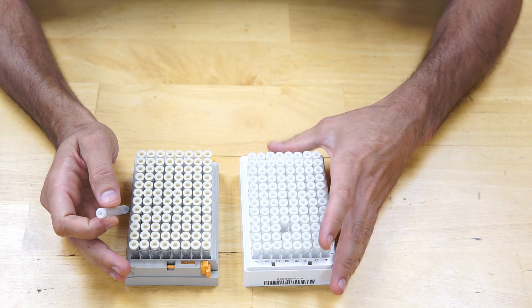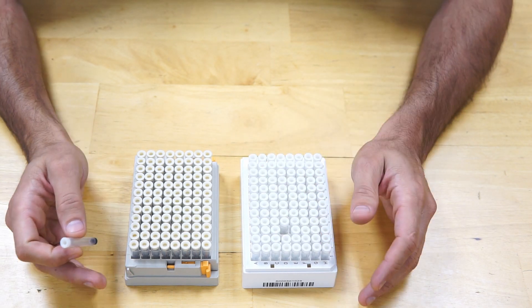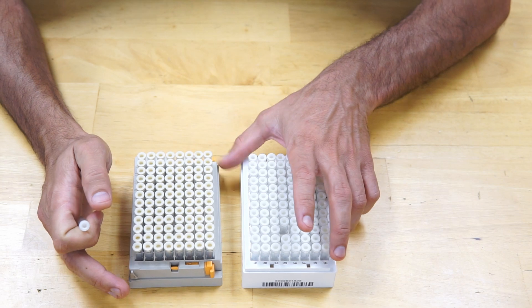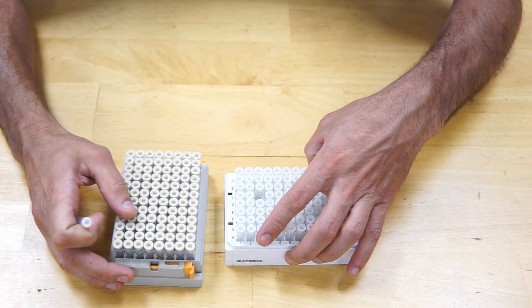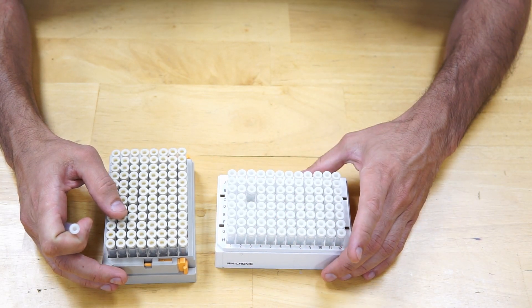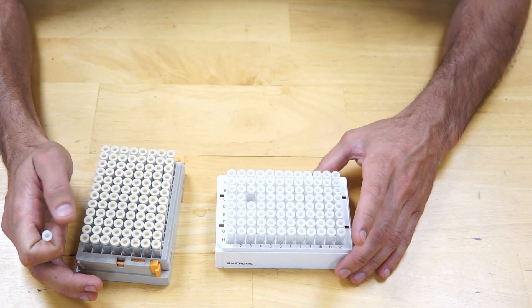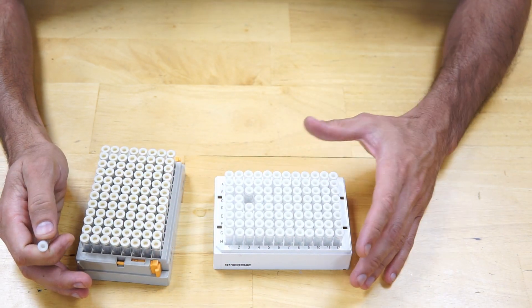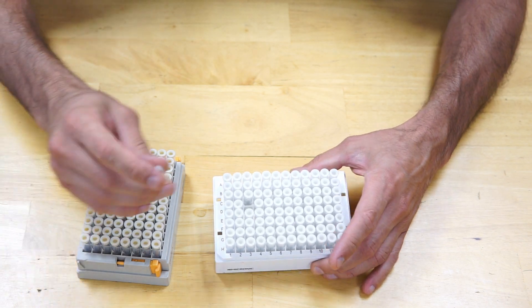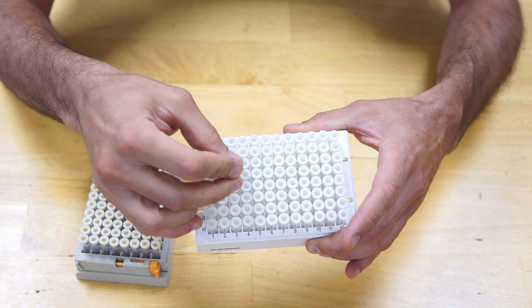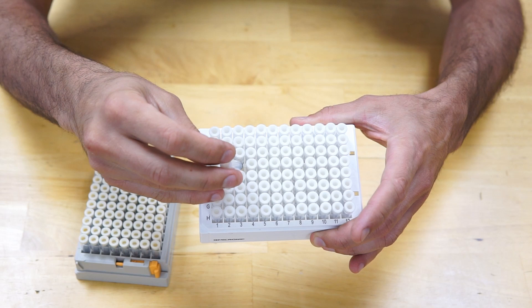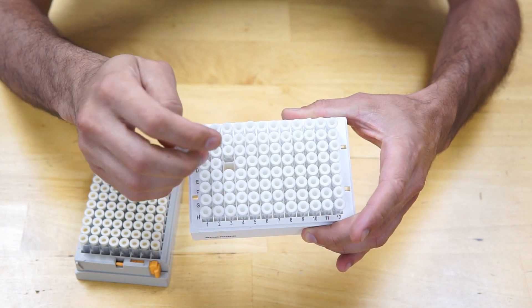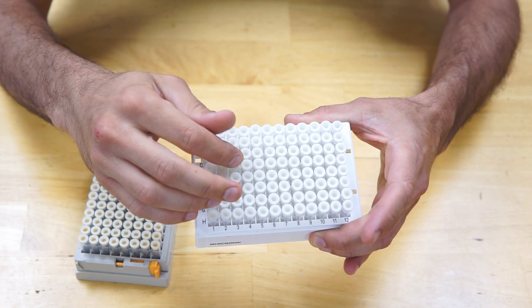There are two hardware challenges that we are dealing with in this problem. First one was fixing the microplates on the desk so the robot can work on them and they don't move around and the user can put them on the fixture and remove them easily. The second one was picking the small tubes reliably from the plates without disturbing the neighboring ones. As you can see there is a very small space between the neighboring microtubes in a plate.